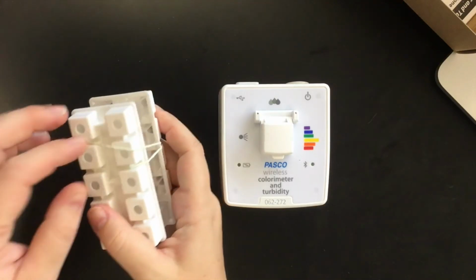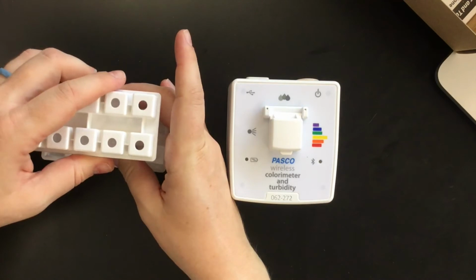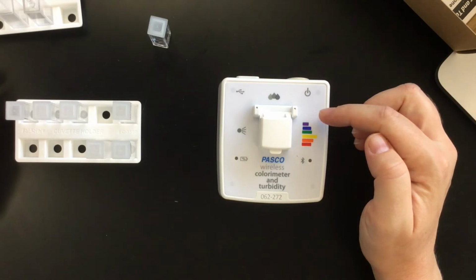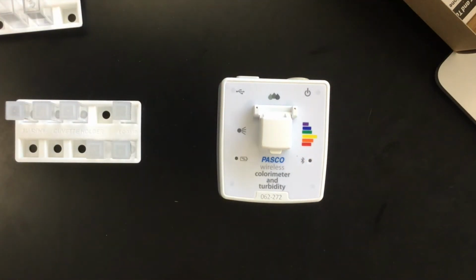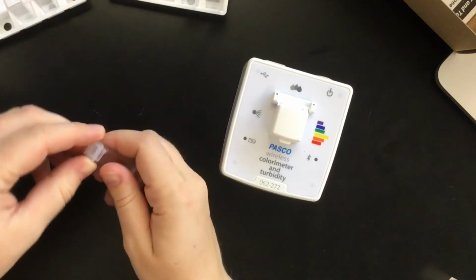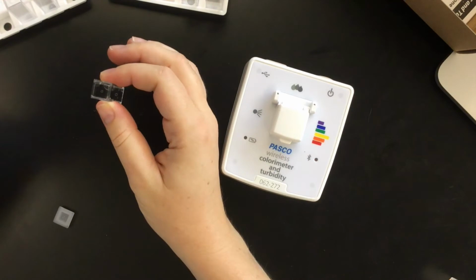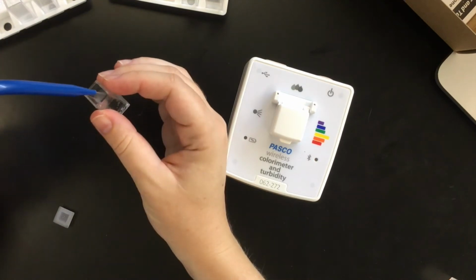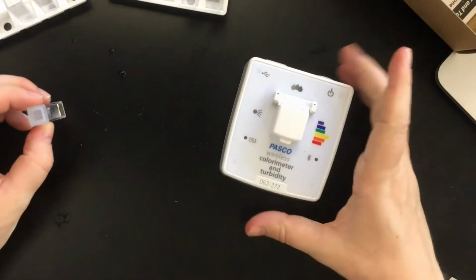To use your colorimeter, you'll first need to unwrap your cuvettes and open them up. Some of them might be stuck to the top, it's fine. Before you start measuring the absorbance of your solutions, you're going to want to calibrate the colorimeter. And we will calibrate with distilled water. So get distilled water from your lab bench, open up a cuvette, fill it up with distilled water, not all the way up to the top, just a little bit below it. Put the cap back on. And then we're going to stick it inside of the colorimeter.